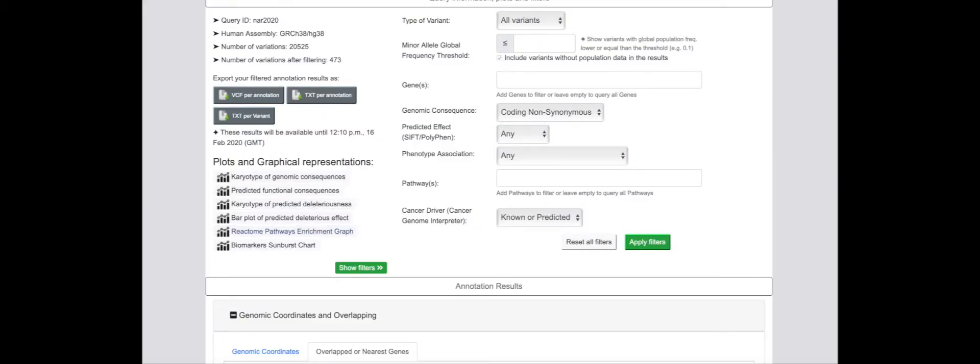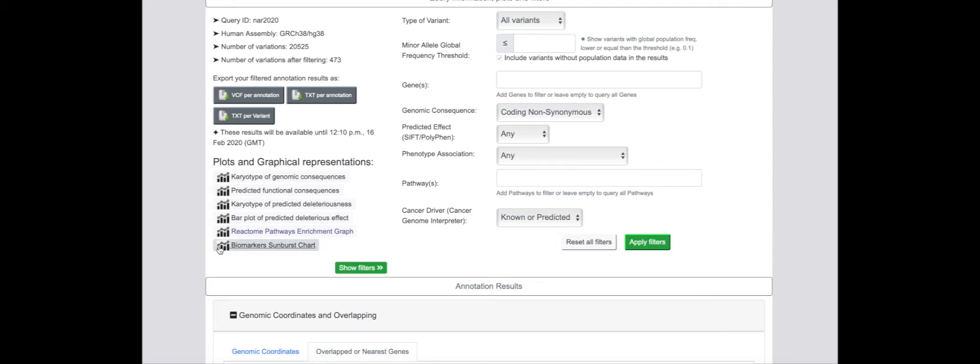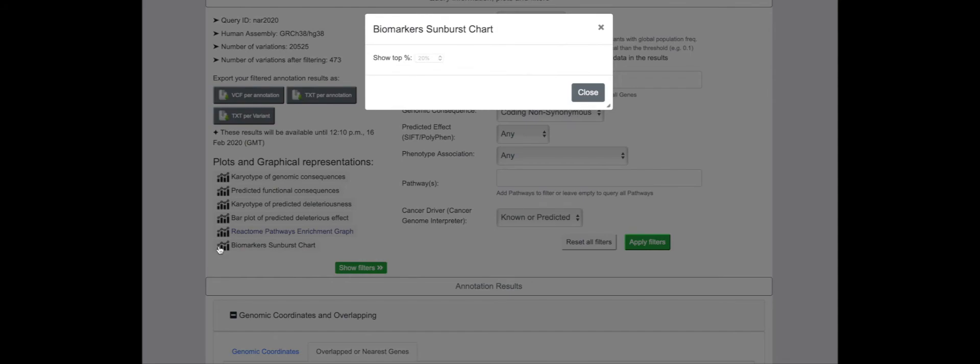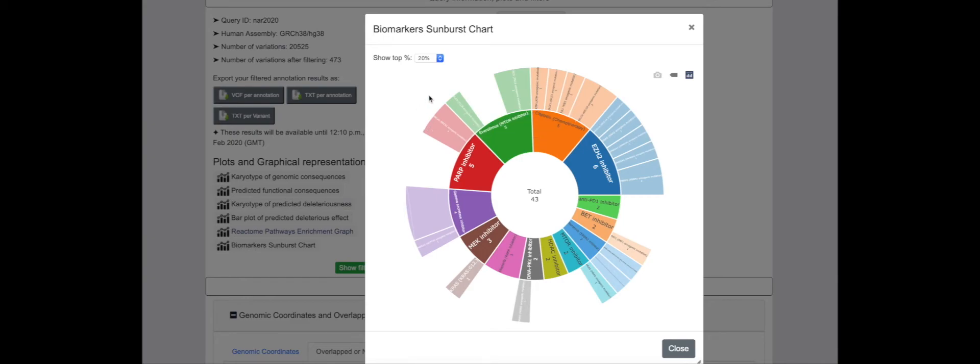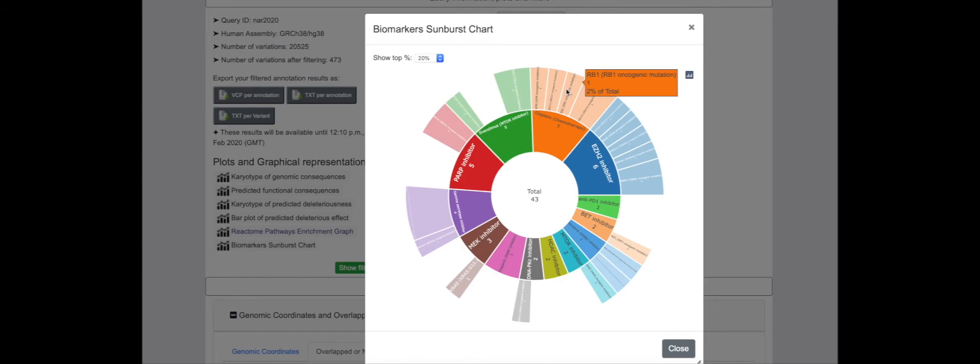To further investigate mutations relevant for targeted treatment, coding variants can be further analyzed for known or predicted biomarkers of treatment response. In this patient, several driver variants have also been identified as potential biomarkers of response to platinum chemotherapy or PARP inhibition.